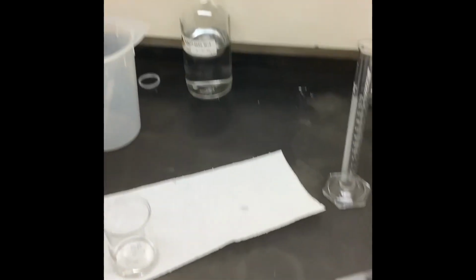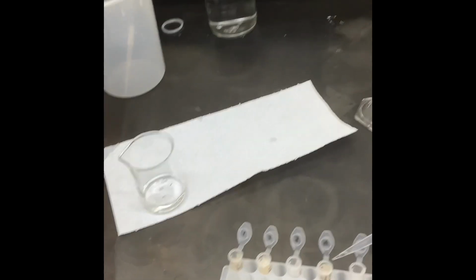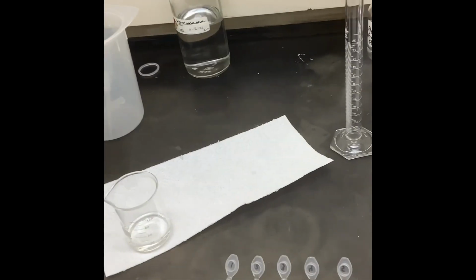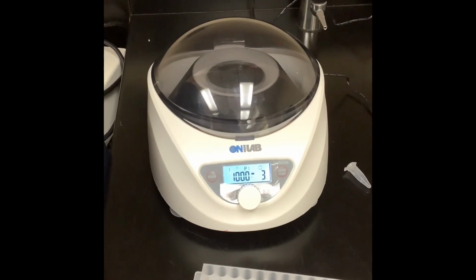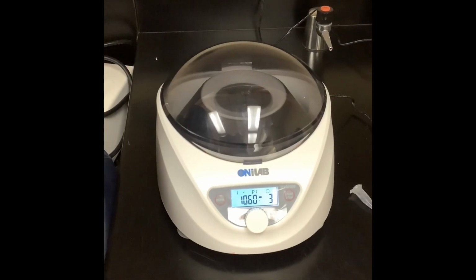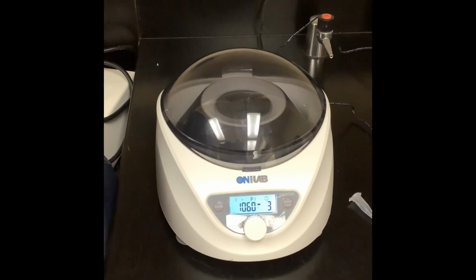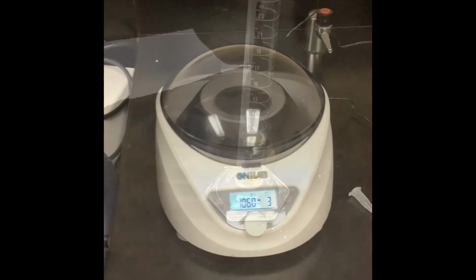When you're pipetting, make sure that you're never touching the tip to any one of the tubes. And if you do, just make sure you eject that tip and put on a new one before you move to the next tube. Otherwise, you're going to have cross-contamination between all your samples. So I have my samples in the centrifuge right now. And I wanted to mention one more thing. Also, try not to leave your tubes open for very long. Only open them when necessary and close them right away after. This is also going to help reduce airborne contamination.